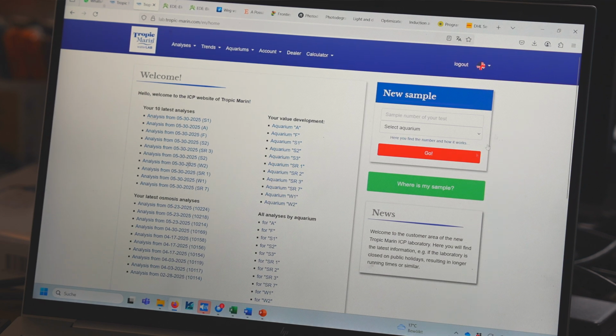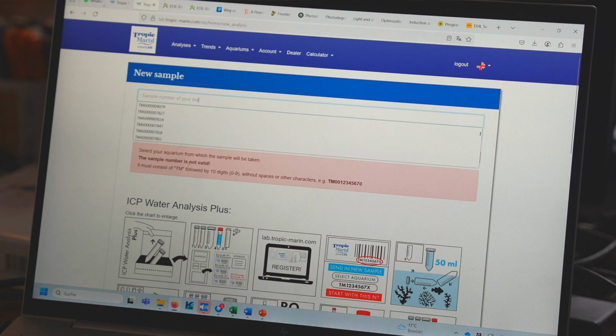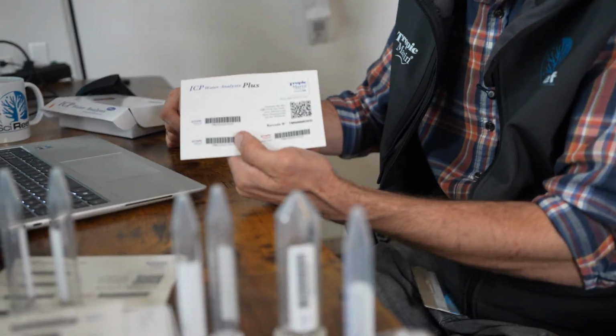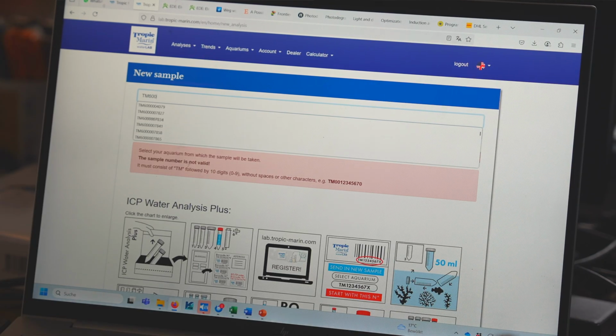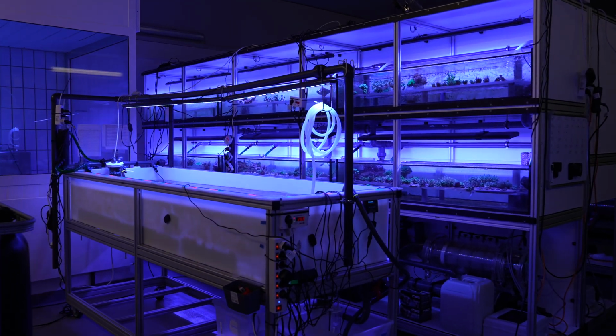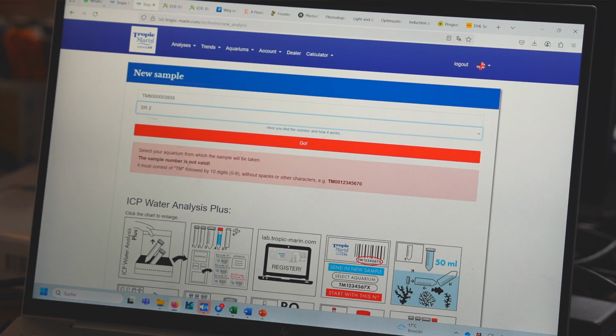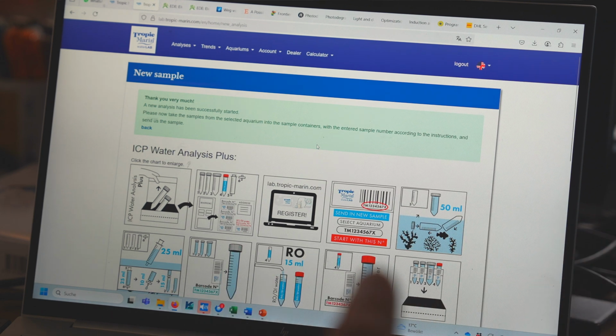So now we want to send in a new sample. We can either go here on the right side, it's already showing that you can connect it there, or you go through analysis and new sample. And then you just type in the barcode number that is seen here. That's the TM6 and then a lot of zeros. And then we do the three, and now we select an aquarium. So you can save basically as many systems, I guess, as you want. We have all our aquarium systems, or almost all of them, in here already. So I can select one that I want to connect the sample with, and in this case it's SR2. And then we just click on go, and it says, thank you very much, a new analysis has been successfully started. So now the water lab knows that this barcode is connected to your tank.